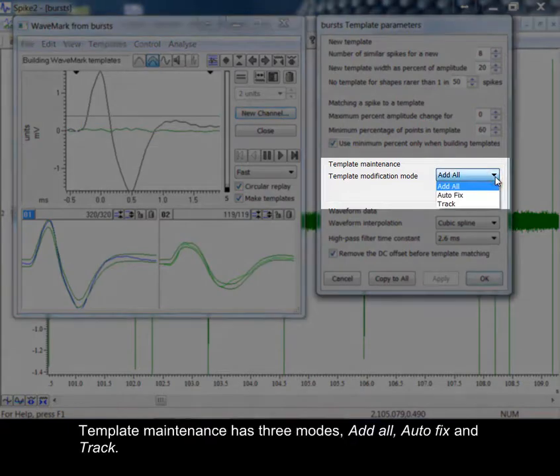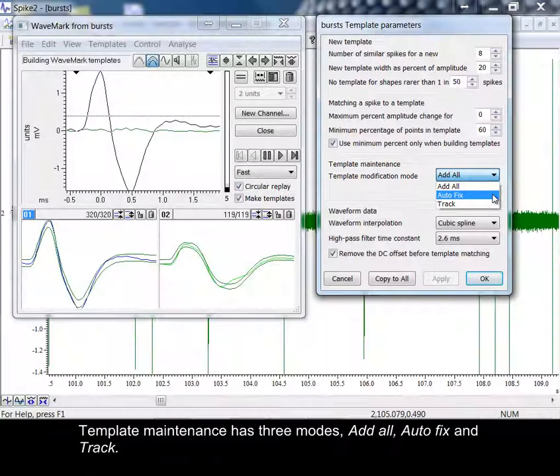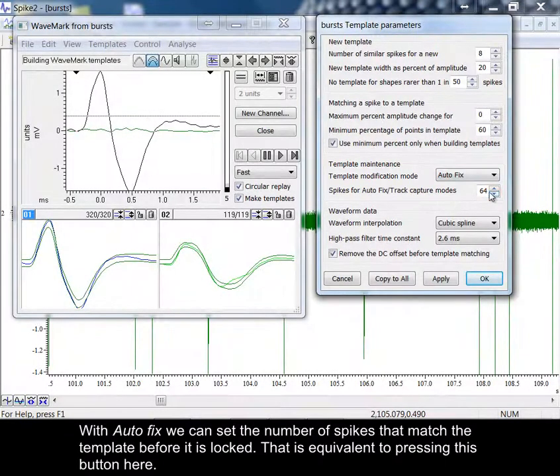Template maintenance has three modes: add all, autofix, and track. With autofix, we can set the number of spikes that match the template before it is locked. That is equivalent to pressing the button here.